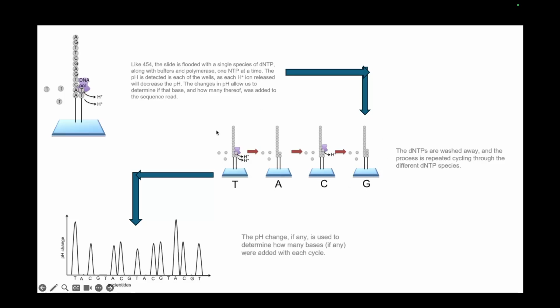After that, the dNTPs are washed away, and the process is repeated, cycling through different dNTP species. So you remember what I said?